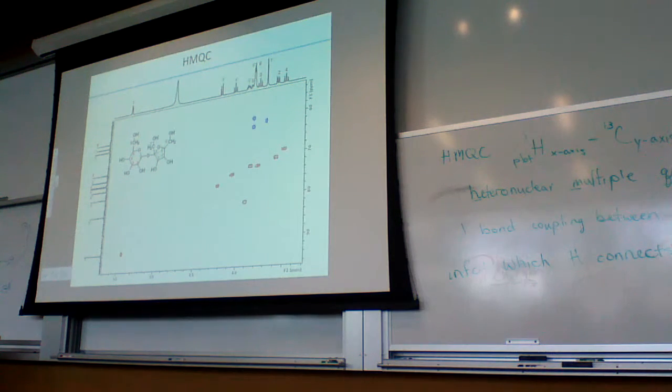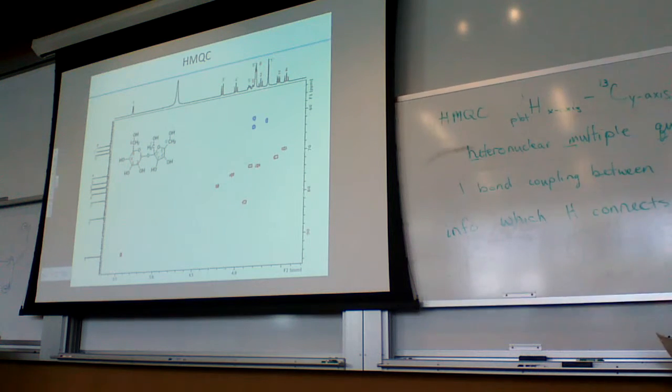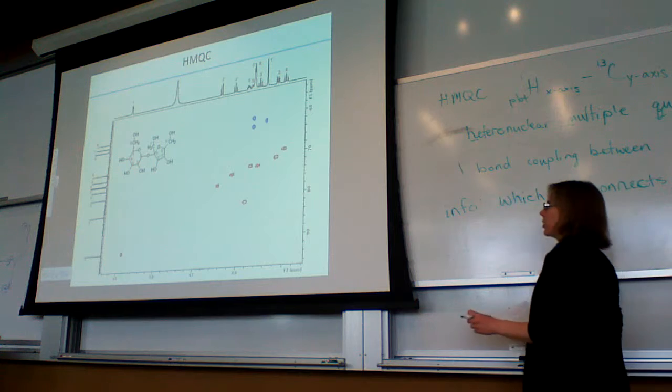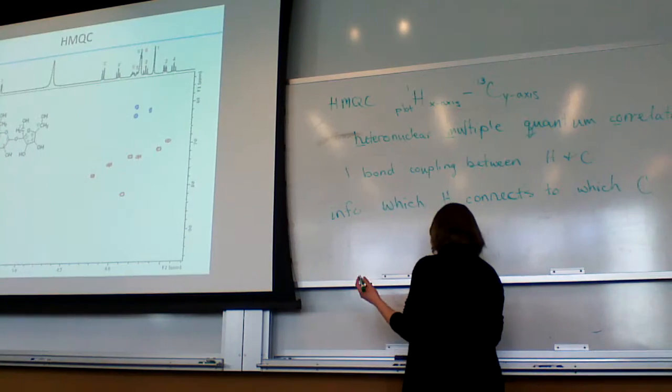Hydrogen, carbon connectivity. Again, this can help you then assign your carbons in your spectrum, which can be complicated otherwise.